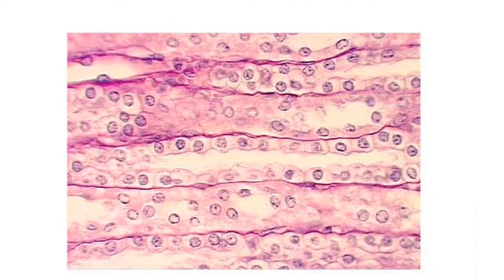All right, I see soda straws, but they're elongated soda straws, right? There's a long soda straw right there with a lumen in the center, one row of boxy cells. So this would be simple cuboidal epithelium. Function, absorption and secretion. Location, kidney tubules or other tubules in the body.